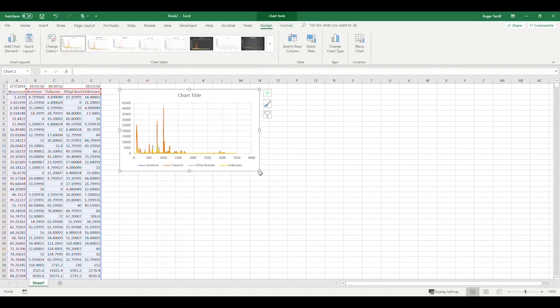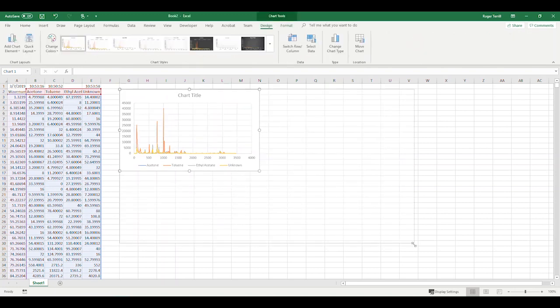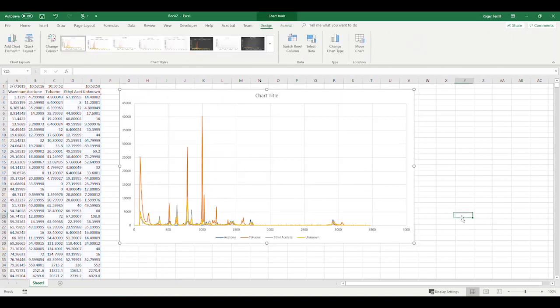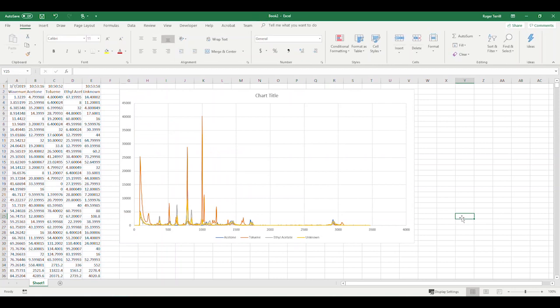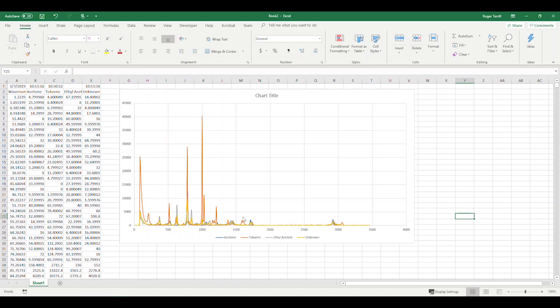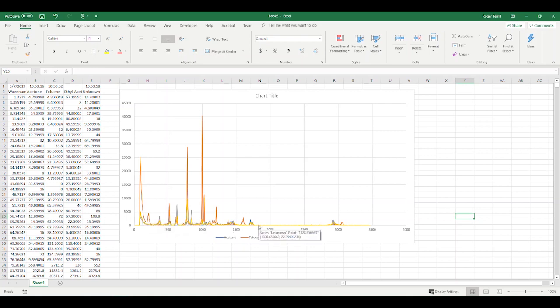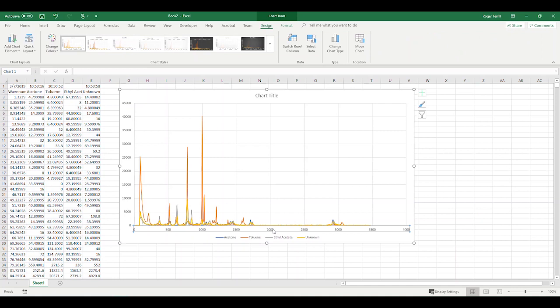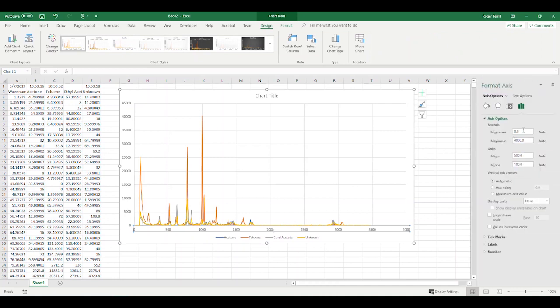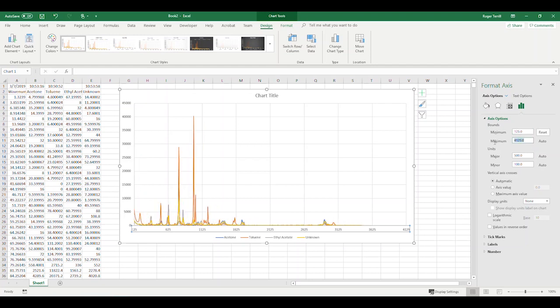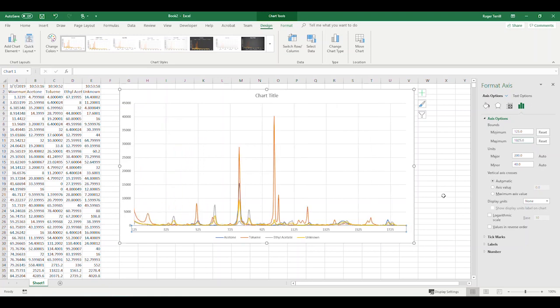Now, the choice of colors is absolutely insanely ridiculous. And also, the choice of wave number limits is a little bit insane as well. There's a couple of reasons. First of all, this peak at low wave numbers is probably some sort of artifact. I think this one's probably toluene. And I'm just going to cut us off here right around, let's say, 100 wave numbers. So we go down to 125, then I'm going to come up here to 1825. So 125 to 1825. That looks a little bit less congested.